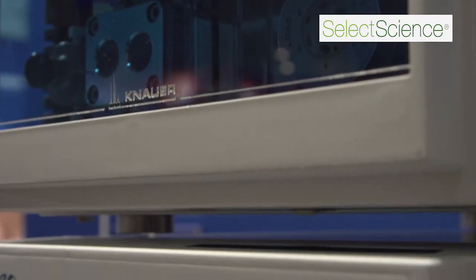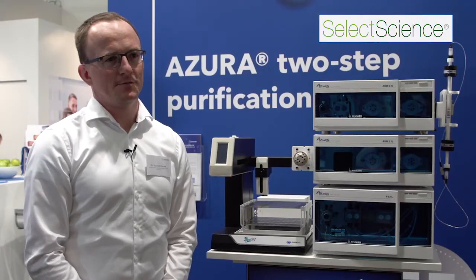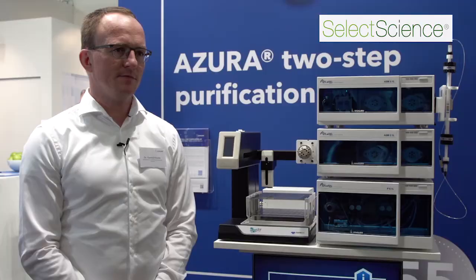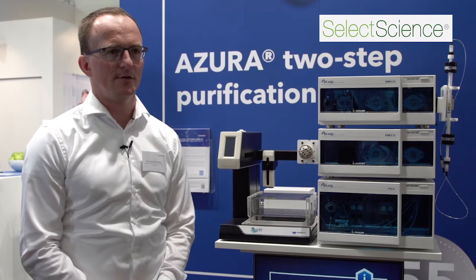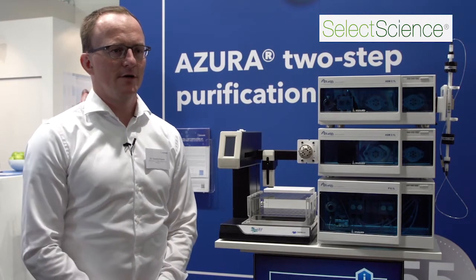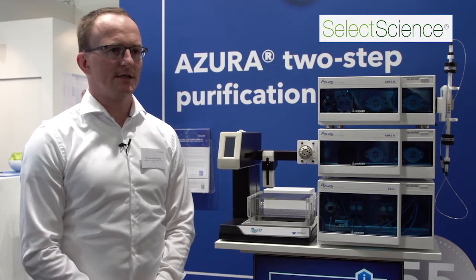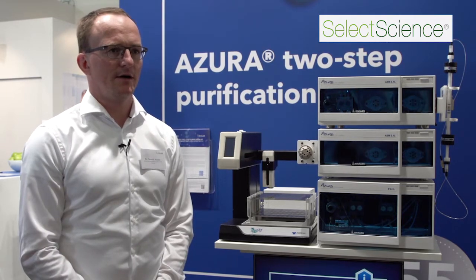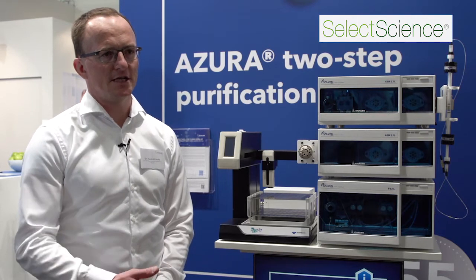It's from our Azura BLC line and it's designed for automated two-step purification. The Azura two-step purification system consists of one pump and two assistants, designed in a way that I can do automated purification. One assistant is mainly used for sample injections, so we have a sample pump and injection valve.